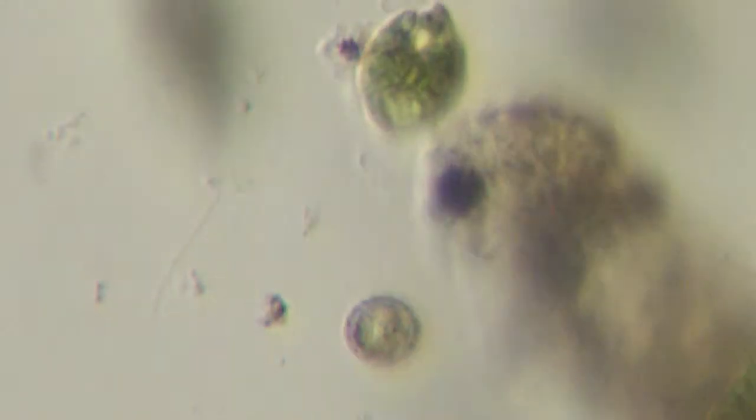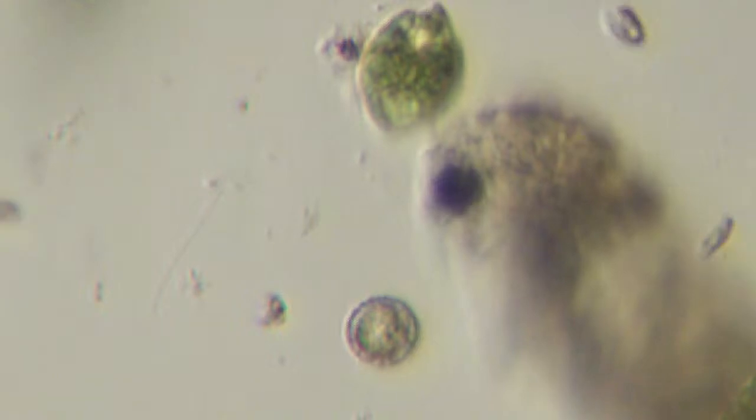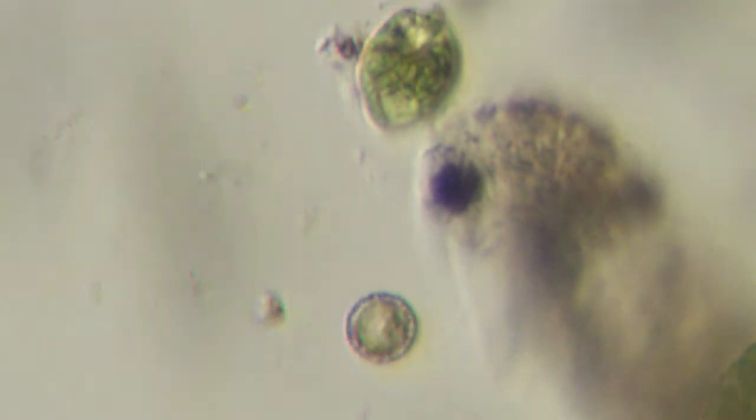I like these little guys here. They're not chlorella, but there are some. Maybe they are a type of chlorella. Small with some greenish pigment. Single cell plants of some kind. But this guy, I'm baffled by this little guy here. I'll have to look that one up.